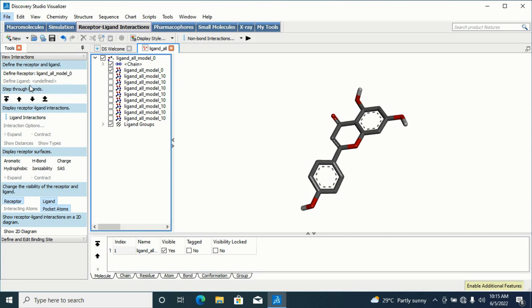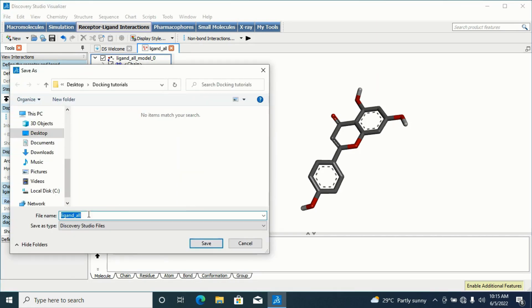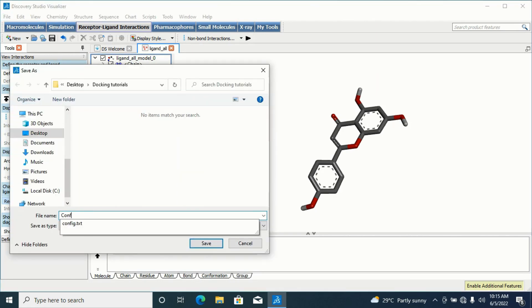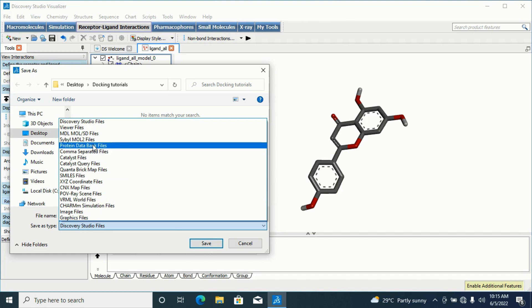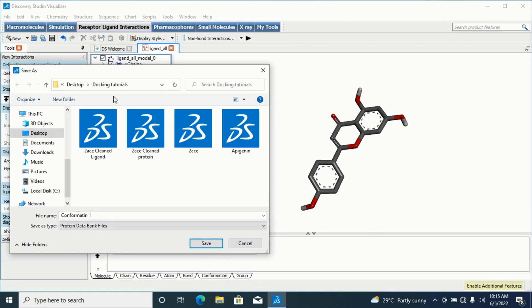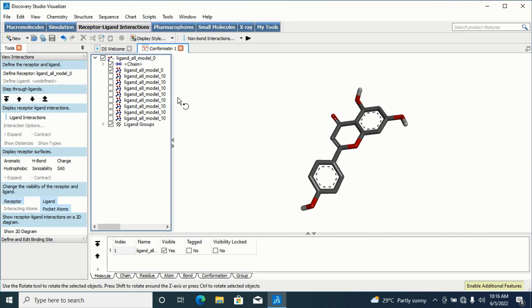To save the first conformation as a PDB file, simply click on it, go to File, and go to Save As. I will save this as 'Conformation 1'. Under the file type, don't save it as a Discovery Studio file — it has to be in PDB format, which is the Protein Data Bank file format. I'll click on it, navigate to my docking tutorial folder, and click Save. I've saved my first conformation.